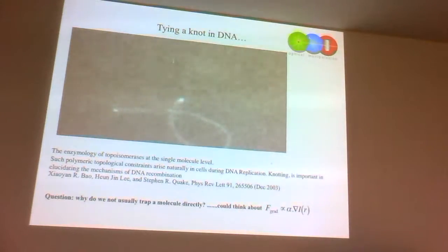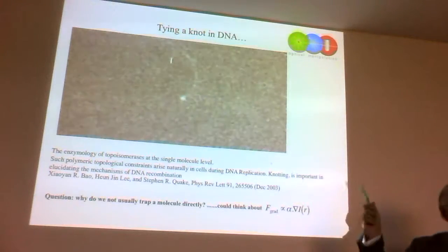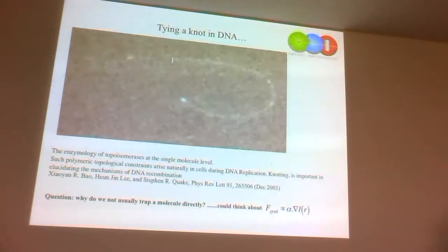And what is the scale on this? First of all, how did they image it, and what is the scale? Yeah, sure. That is a single piece of lambda phage DNA. Those will be 1 micron beads, so you're looking at a field of view of maybe 50 by 50 microns.